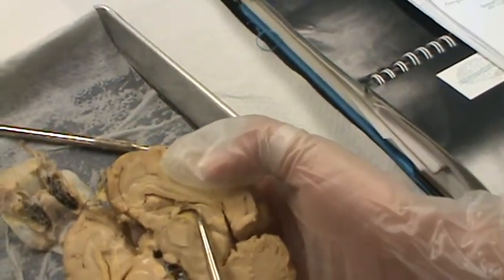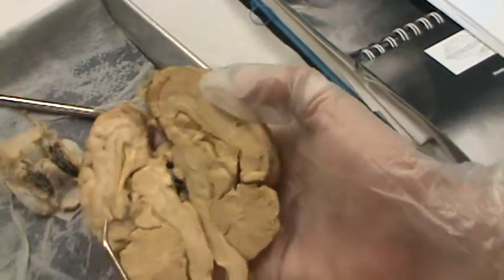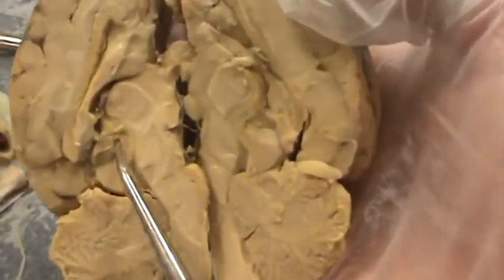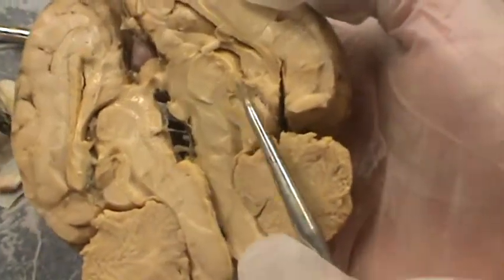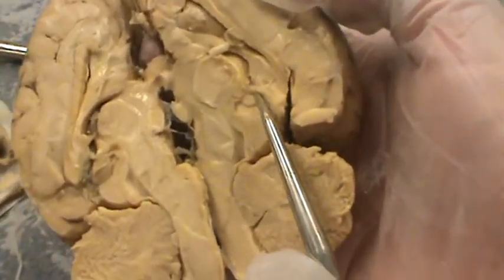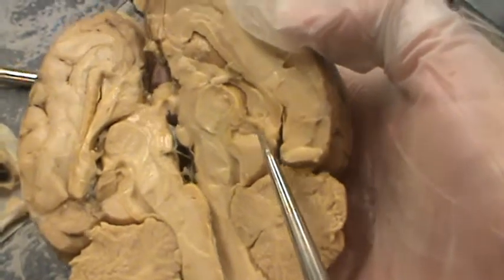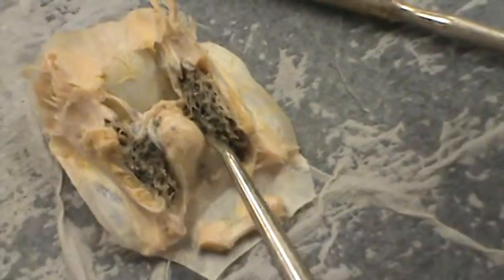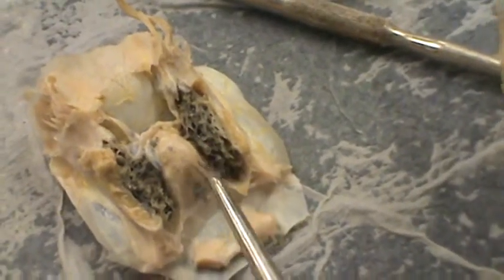Third ventricle. The pineal body is going to be this P-like structure. Pineal body. And I think on this side it's very small. The pituitary gland is going to be this floppy piece, which is the center area. Pituitary gland.